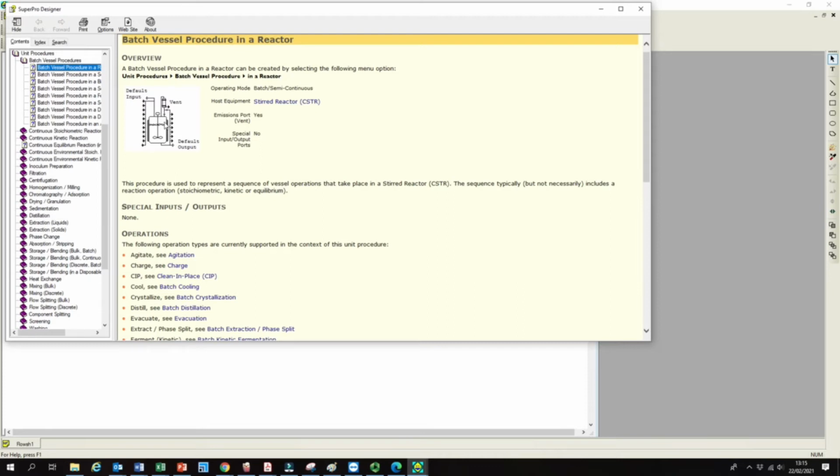So we have to remove those gases out. So we have to vent them. So we call it a venting port. Only this port can be used to vent the gases out. You cannot use the other ports as a vent. So if you want to remove the gases generated inside your reactor, you can use only this particular port, which is on the top of your reactor.